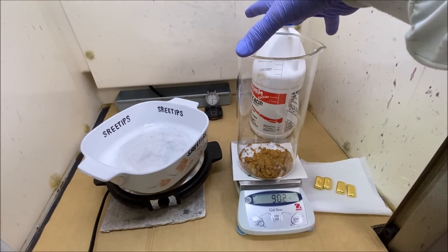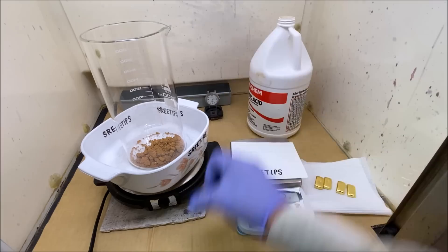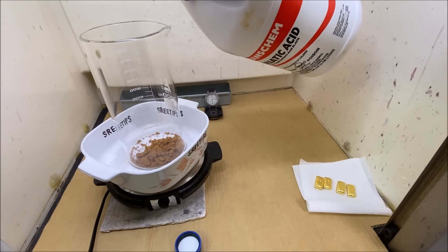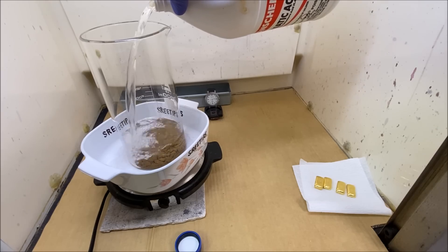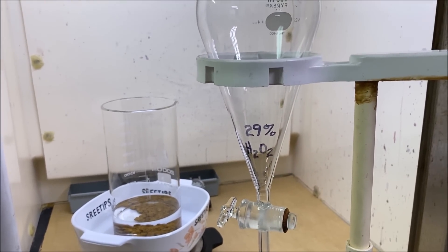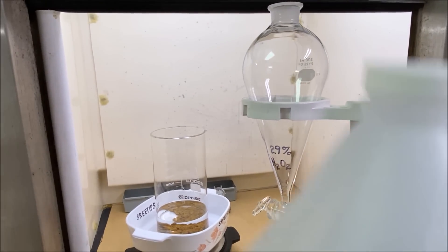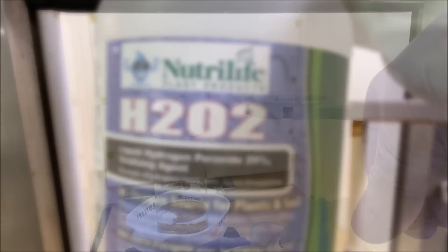Now we'll take the beaker with the 90 grams of gold in it, set it up on some heat, and add about half a liter of hydrochloric acid to the pure gold sponge. We're going to start adding heat to our gold and hydrochloric acid mixture. I've also got a separatory-type funnel, and we're going to use it to add some 29% hydrogen peroxide.